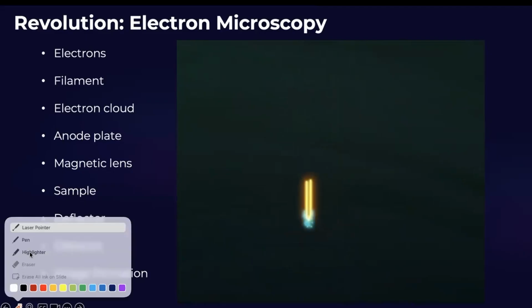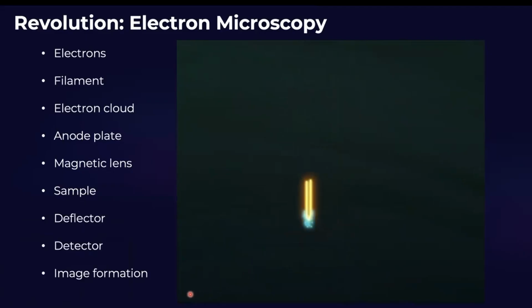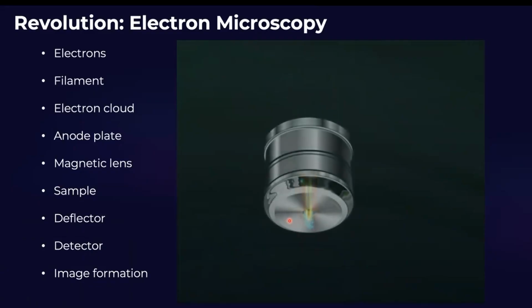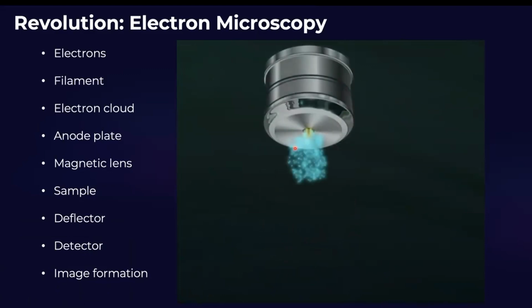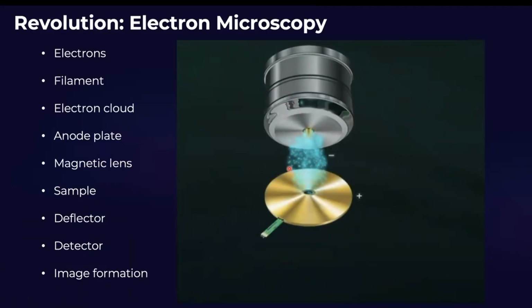In an electron microscope, the source of electrons is a U-shaped filament. It can be tungsten or lanthanum boride, depending on the type of microscope and source. The video I'm showing here is more for a scanning electron microscope, but the generation of electrons and guiding of this electron beam remains the same. So now if you apply high accelerating voltage, you eject the electrons, you generate a cloud of electrons. Now when the cloud of electrons is there, it scatters in the air.